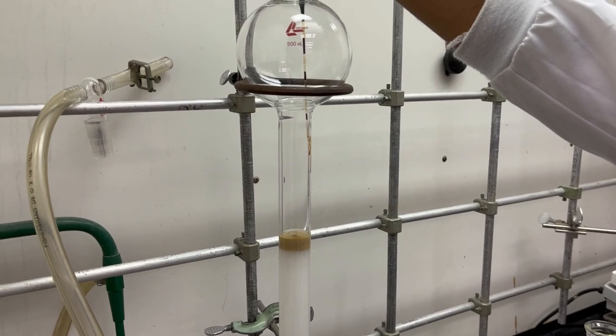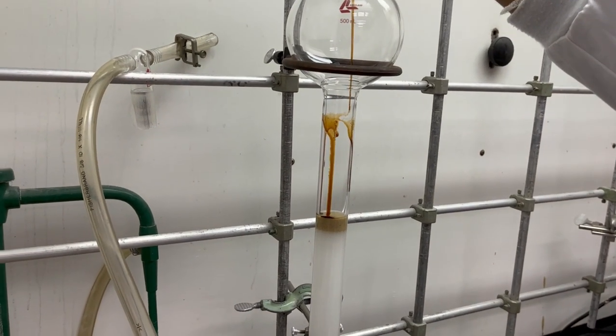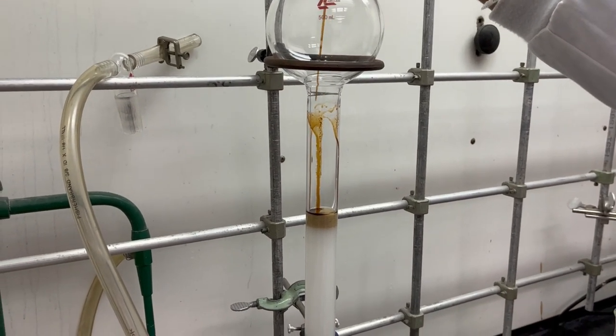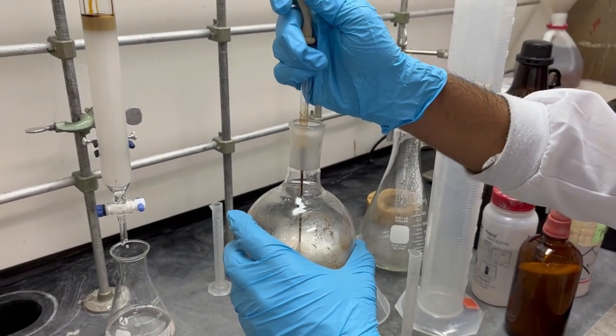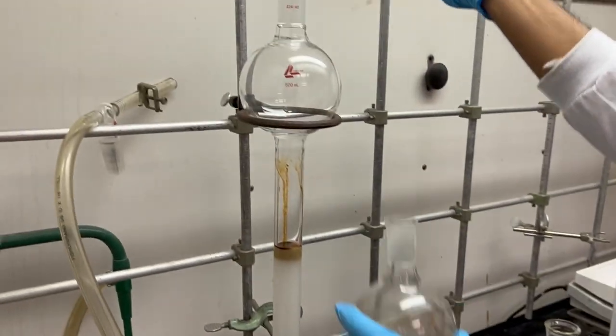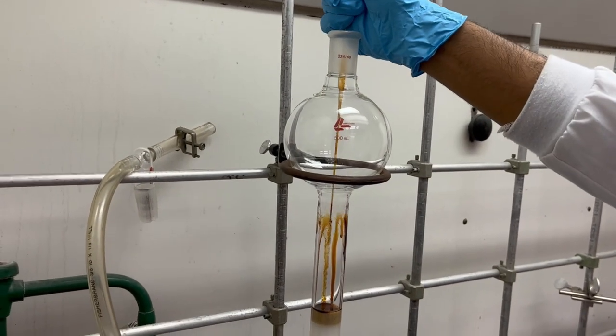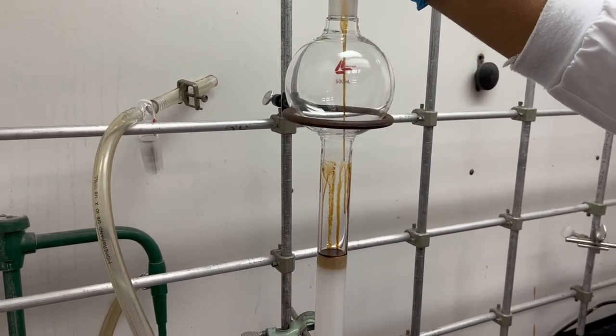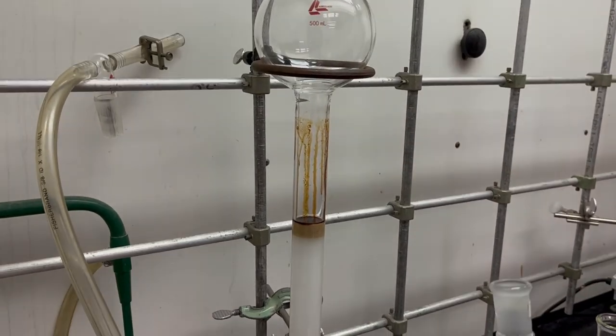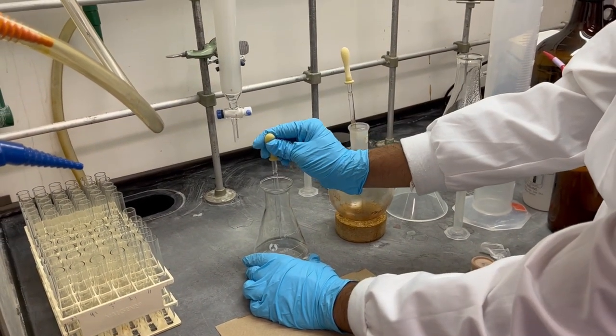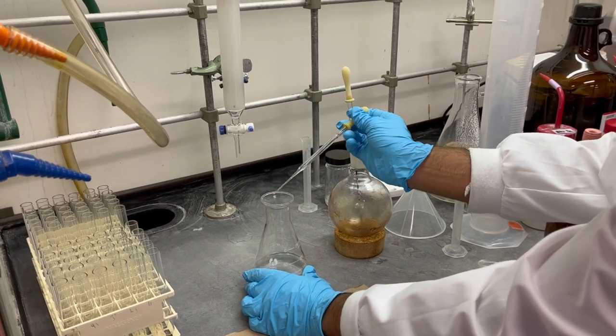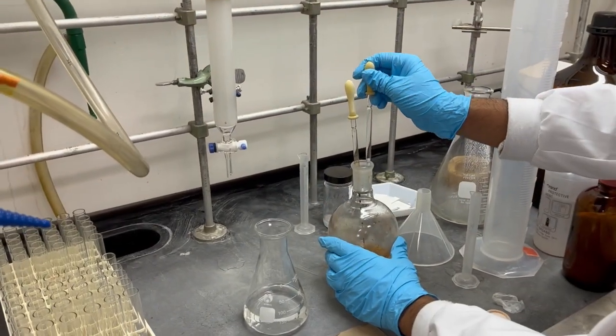Then, the mixture is loaded into the column with the help of a long pasteur pipette. The mixture should be as concentrated as possible while still dropping easily out of the pipette onto the sand layer. It is added in circular motions along the column walls for even distribution. The round bottom flask containing the mixture is then cleaned with small amounts of solvent to minimize losses during transfer.